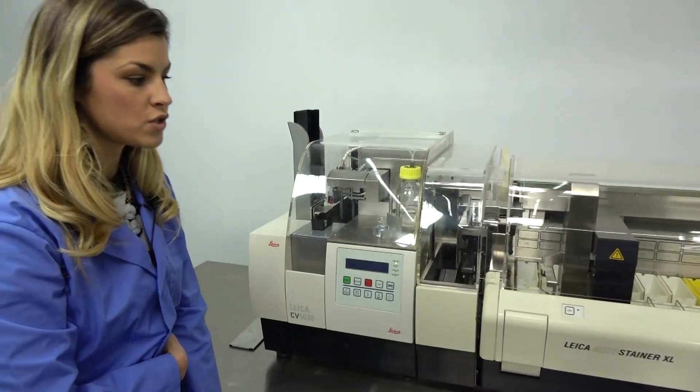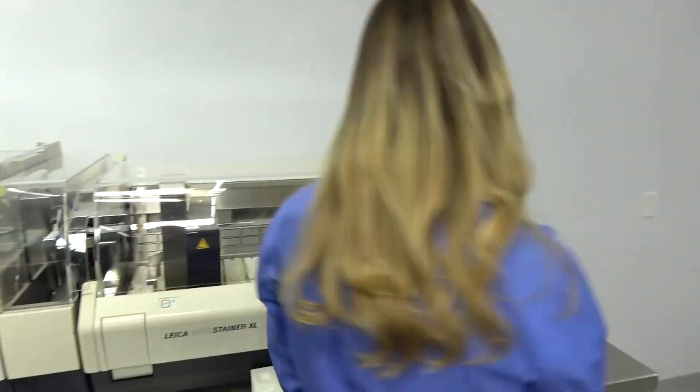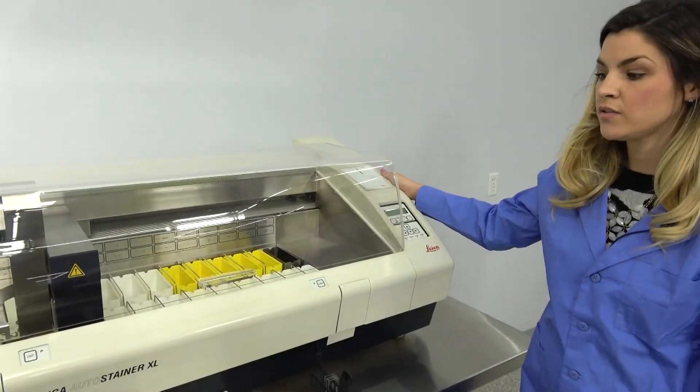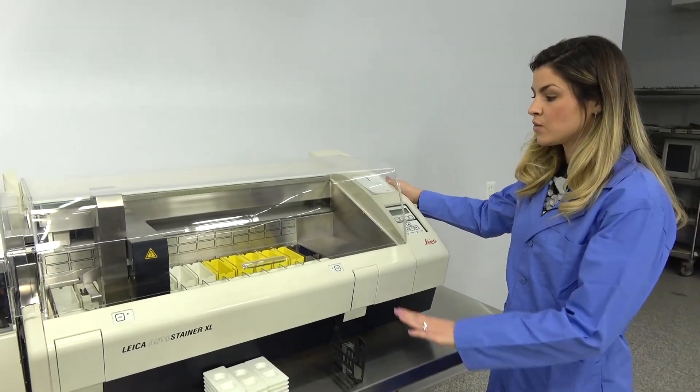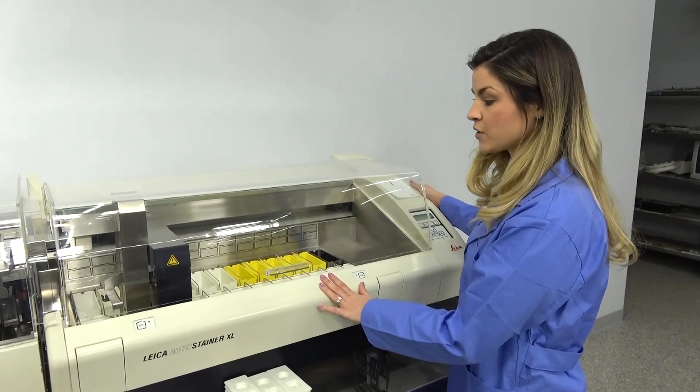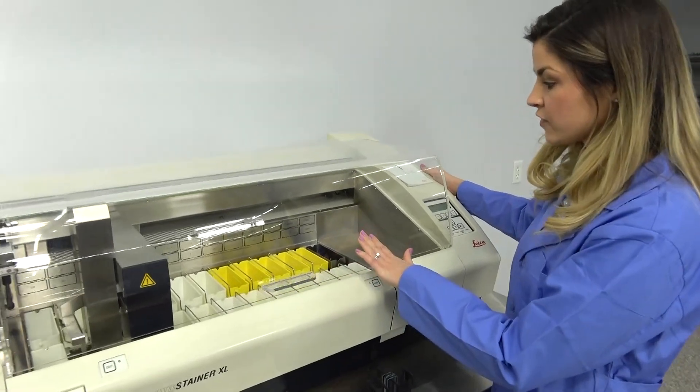Now we're going to move over to the Auto Stainer. This machine will give you the ability to program 15 different programs, and within here is 18 different reagents and five different wash stations.